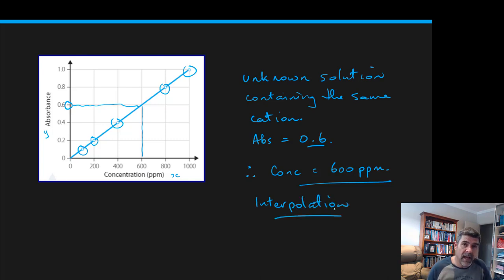One of the things that we will look at is we want to try as much as possible to avoid extrapolation. Because even if the curve for the small range of values that we look at starts nice and straight, it may curve at some point at higher concentrations. And of course, if we've only got a small portion of that line, we can't assume that it's just going to go on forever. We need to make sure that we have additional data if we're going to do that.